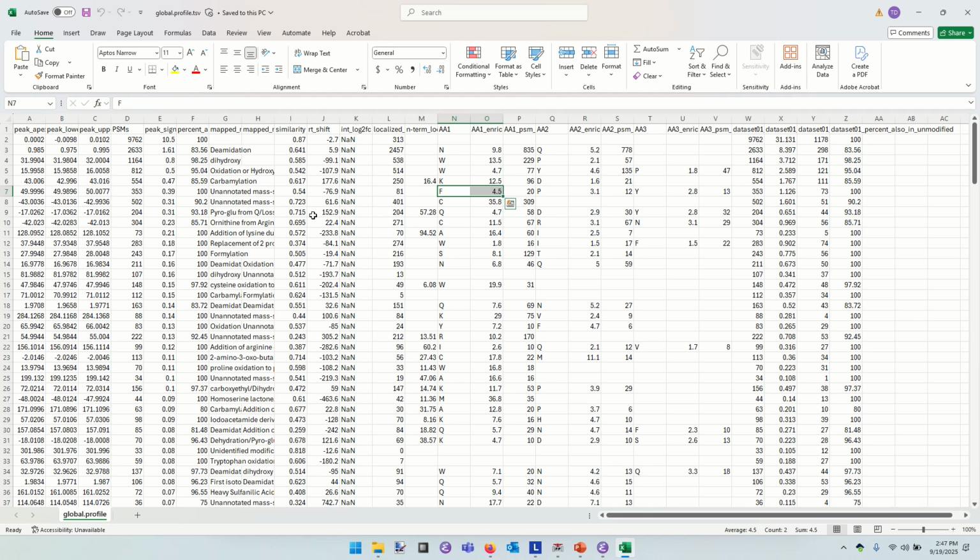But that mass shift would not have been 50, right? Why not? Well, because unless all of the modifications happen on the phenylalanine, if you have a chain with multiple modifications, but not on the same amino acid residue, then the shift in mass that you see when you remove the phenylalanine versus having it there is not going to be 50, because you still have a fragment and another modification elsewhere. Okay.